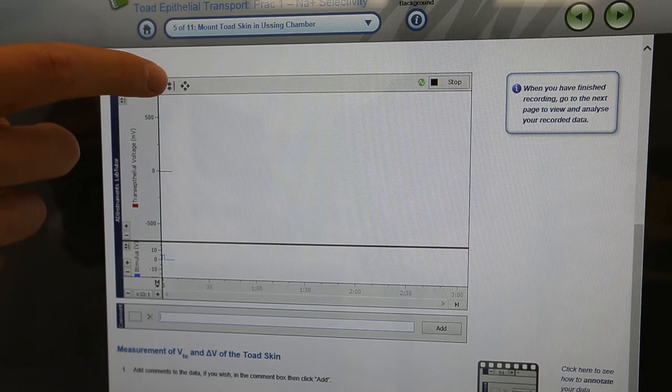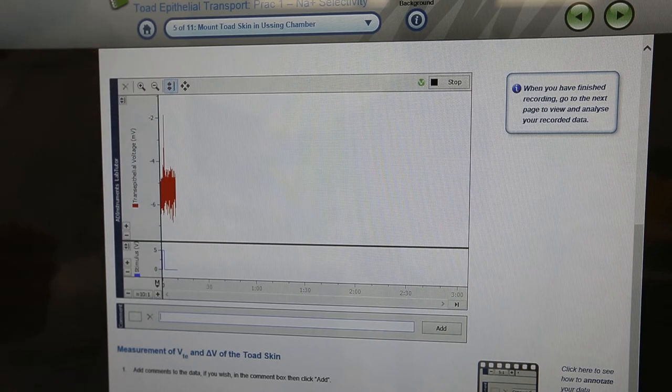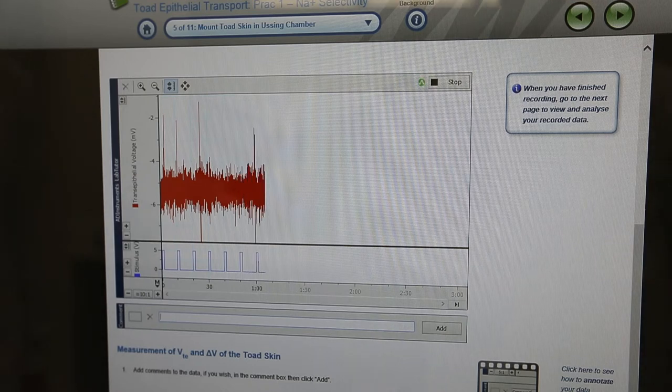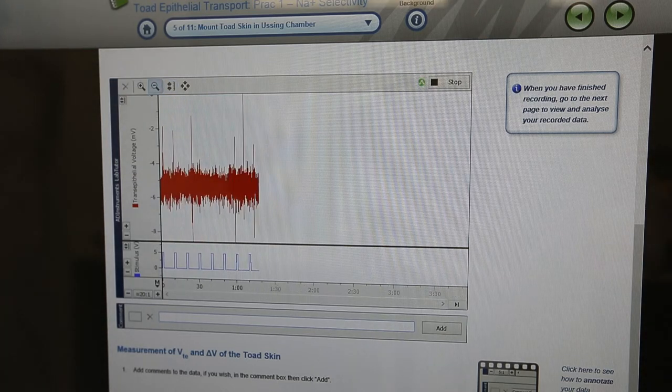If you need to, you can press the auto scale button either in the individual channels as you did before or at the top of the window, which will adjust both channels at once. You will now need to let your trace run for 10 to 15 minutes. This lets your tissue equilibrate to its new environment before you begin your experiments. For the sake of time, the video has been sped up here.